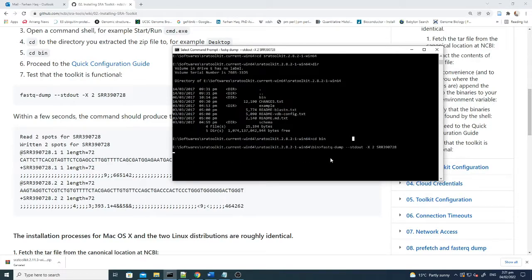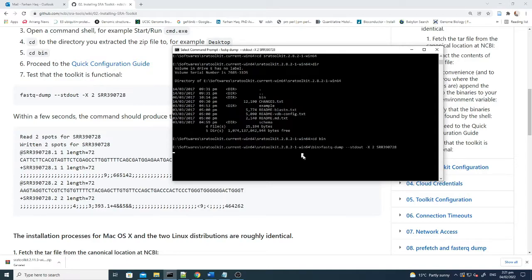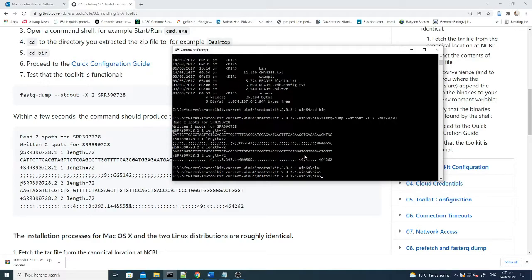If this command is working fine, it means that our documentation for the SRA toolkit is done. You just need to download the zip file, extract it, go to the extracted folder, navigate to the bin using command prompt, and paste this command. By pasting this command you can easily see if the file is working or not.